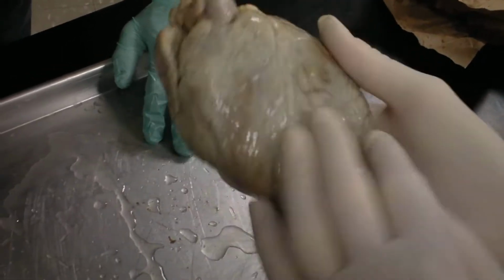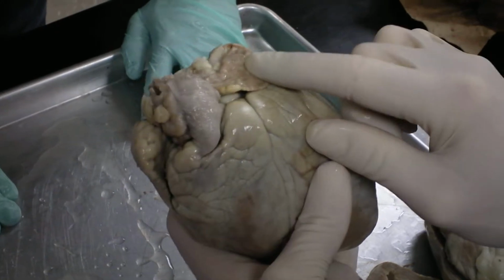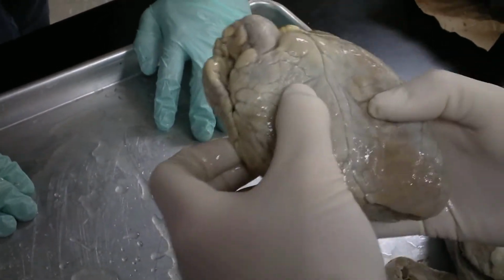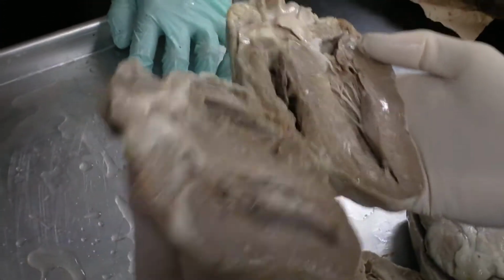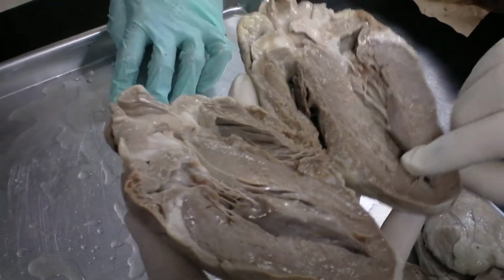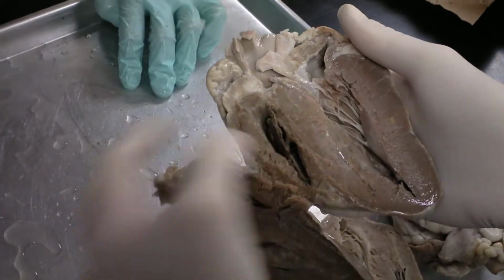This is the front of the heart. See, this is atria, ventricle, ventricle. Open it up. This ventricle has thick muscle, so it's the left. This one is thin muscle, so it's the right.